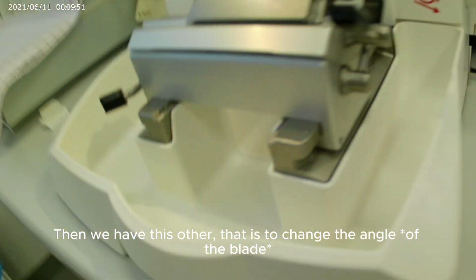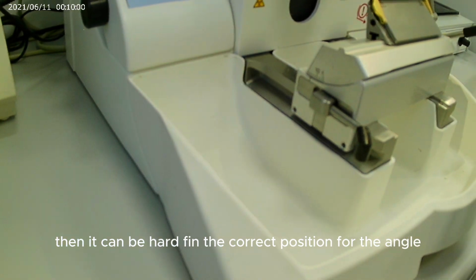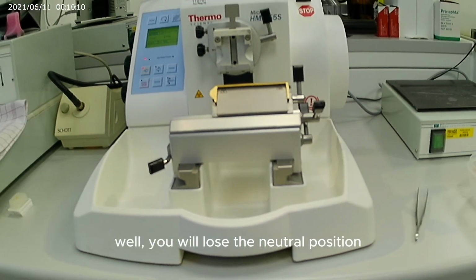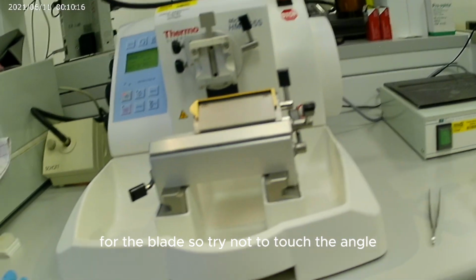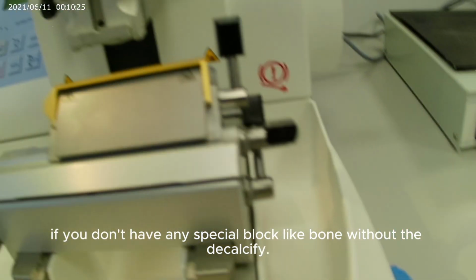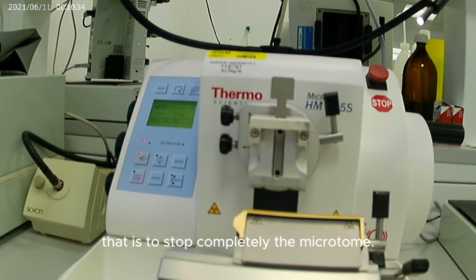Then we have this other that is to change the angle, and try not to touch it because then it can be hard to find the correct position for the angle, and you will lose the neutral position for the blade. So try not to touch the angle, because normally it's not necessary if you don't have any special block like bone without decalcifying. Then we have this red button that is to stop the microtome completely.